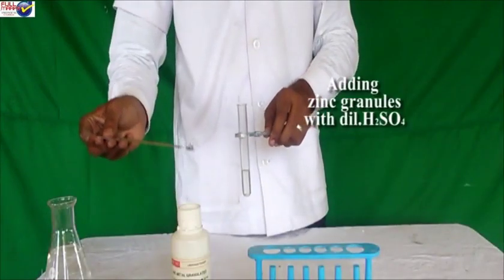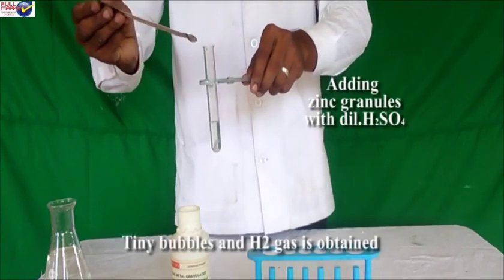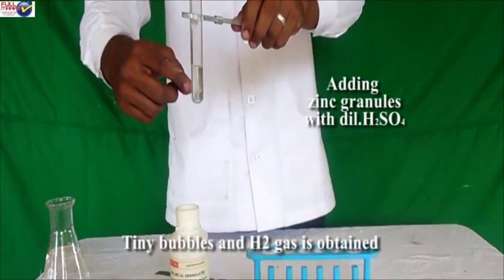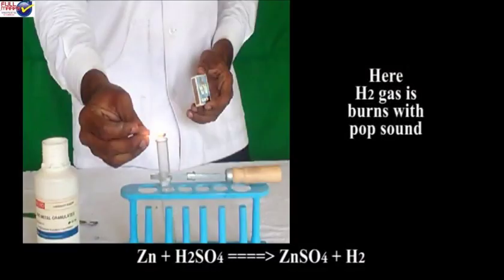3. Take 5 ml of dilute H2SO4 solution in a test tube and add a zinc granule to it. Test hydrogen gas by bringing a burning matchstick near the mouth of the test tube. Hydrogen gas burns with a pop sound.